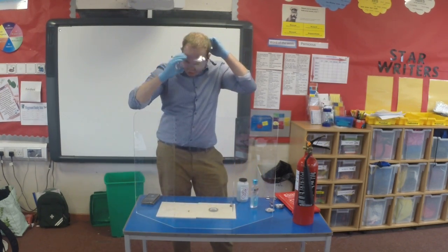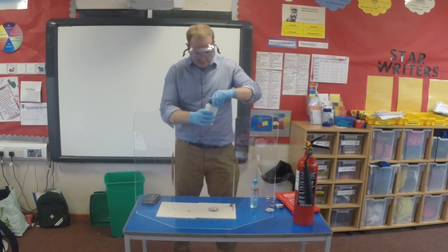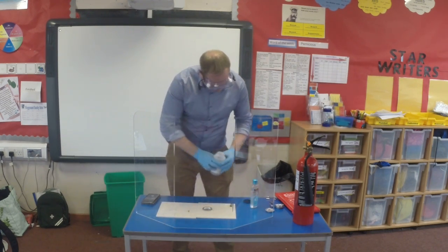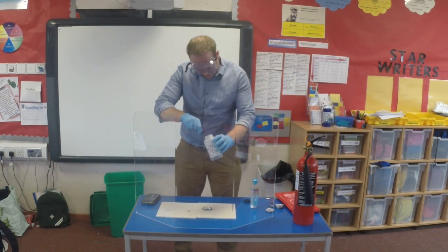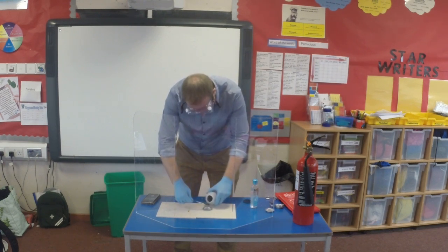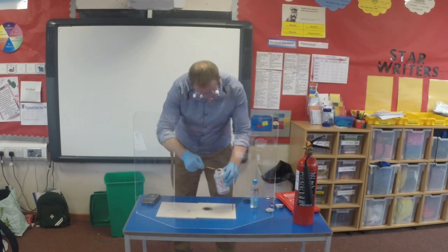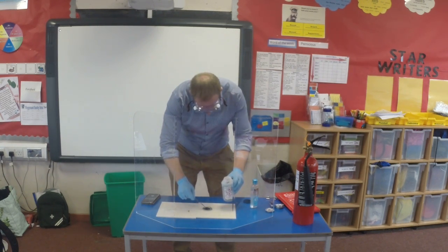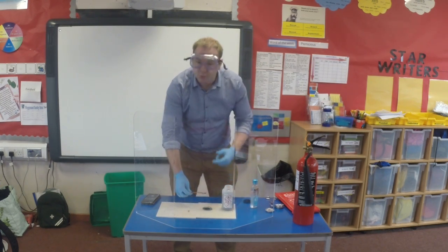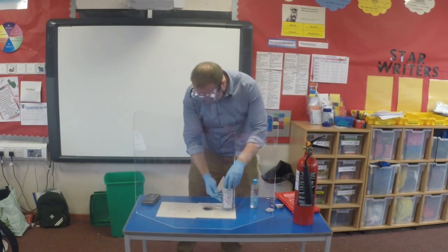Now, we're going to start off by taking some potassium permanganate and popping it in this tray here. I'm going to take probably a couple of spoonfuls, no more than 10 to 15 grams at the most, probably even less than that. It's a very good idea to wear gloves for this, because this can stay in your hands and it is not the most environmentally friendly of substances, and we're going to talk about disposal of this at the end of the video.